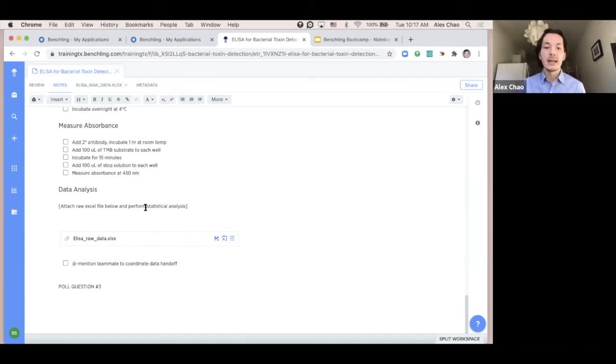for your data. Essentially, folks are editing data that's being sent over email on their personal device, and we understand that this can create a high number of versions of your data. I certainly know I experienced this in my time as a researcher. We, for example, had spreadsheets where we captured information on different animals that we were using in the laboratory.